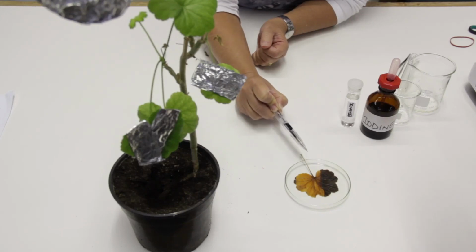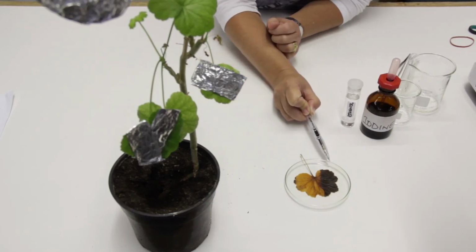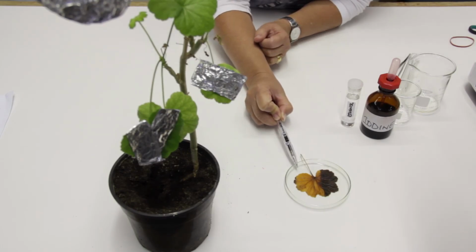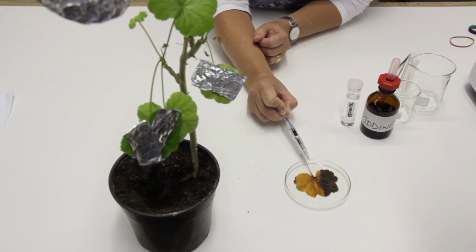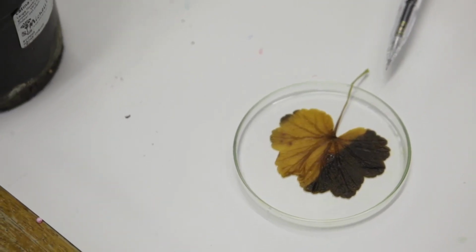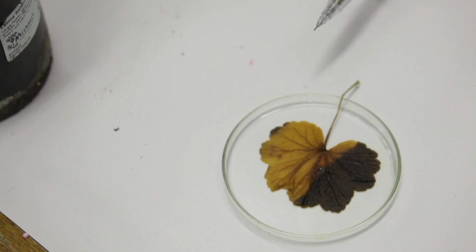Once we have our results and we have observed that when light was allowed, we saw that a positive color change occurred, and when light was not allowed, the covered parts did not change color, we can now take those results and see that our conclusion would be light is definitely necessary for photosynthesis.